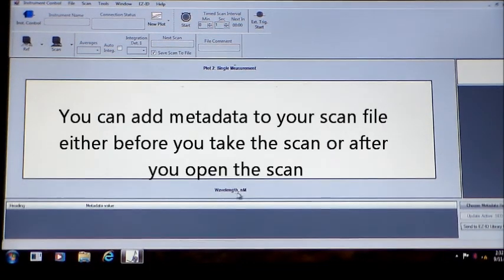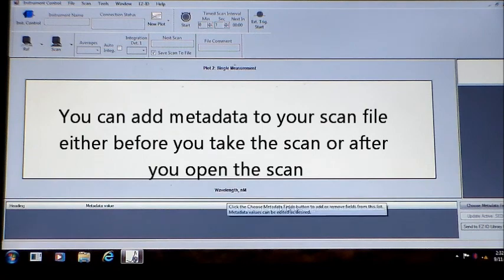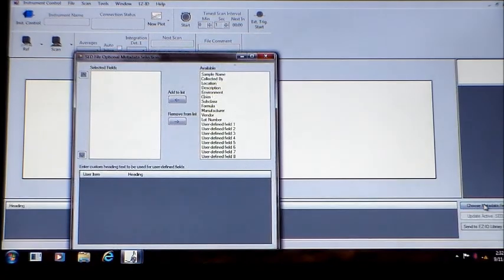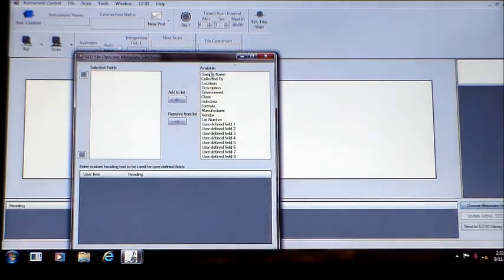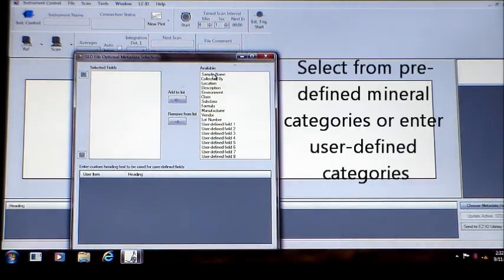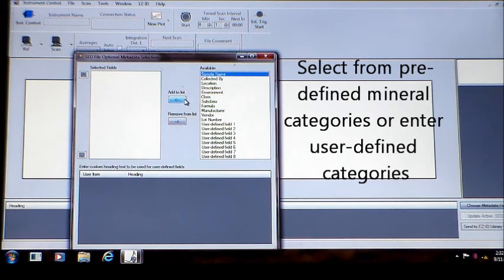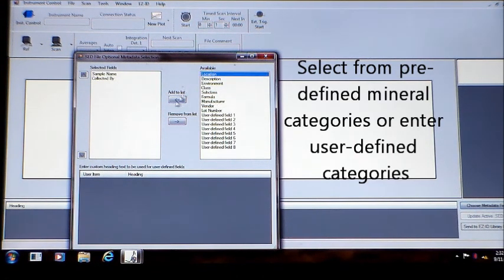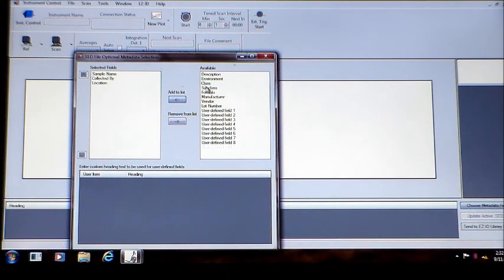You can add your metadata before you take a scan or after. Select from several predefined metadata categories including sample name, location, environment, class, and more, or define your own category.